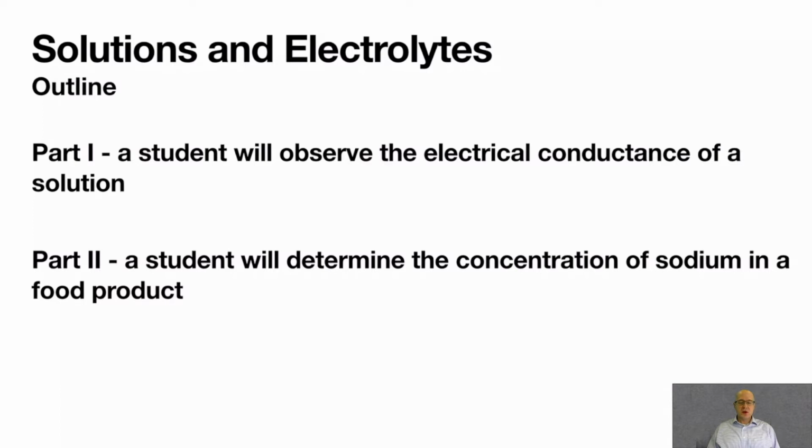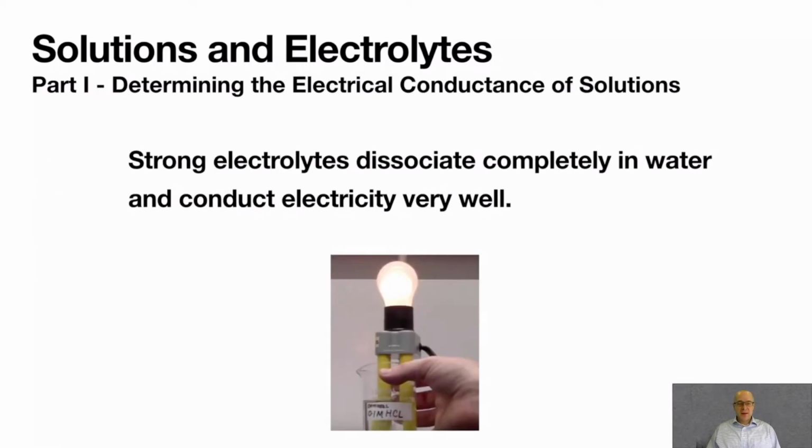Part 2. A student will determine the concentration of sodium in a food product. So you're going to grab another food off your pantry or from your fridge that has a nutritional label, and we're going to do some math with that. All right.